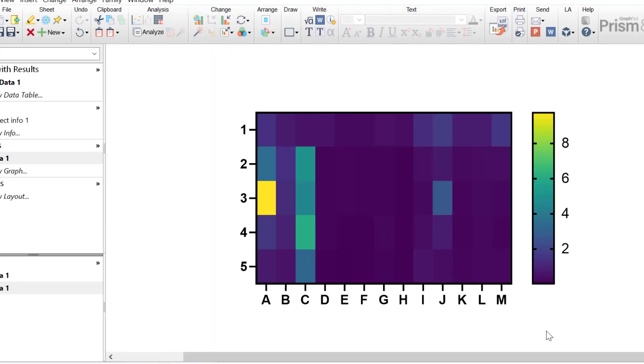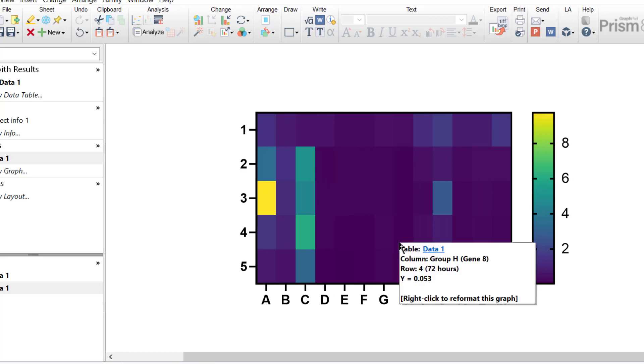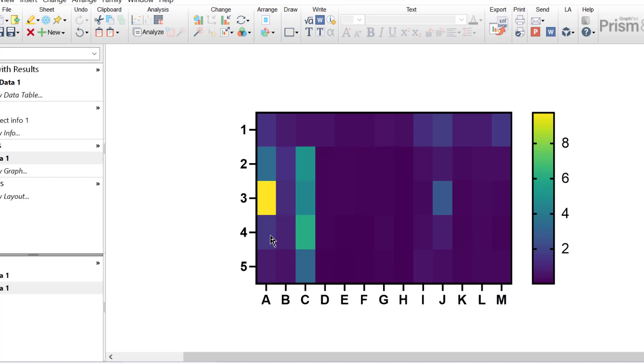So we have the heat map containing the raw data. Each cell corresponds to the data point within the data table. The colour of the cell in this case represents the gene expression value. Cells coloured in yellow represent those with the highest gene expression. Cells coloured in dark blue represent those with the lowest gene expression.